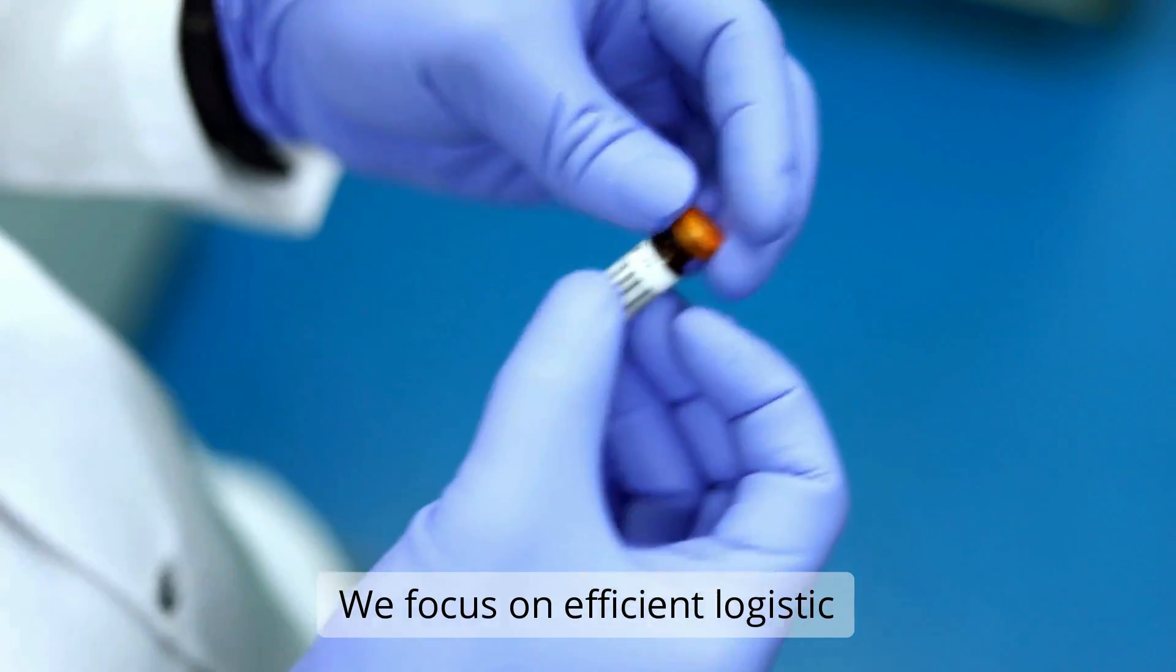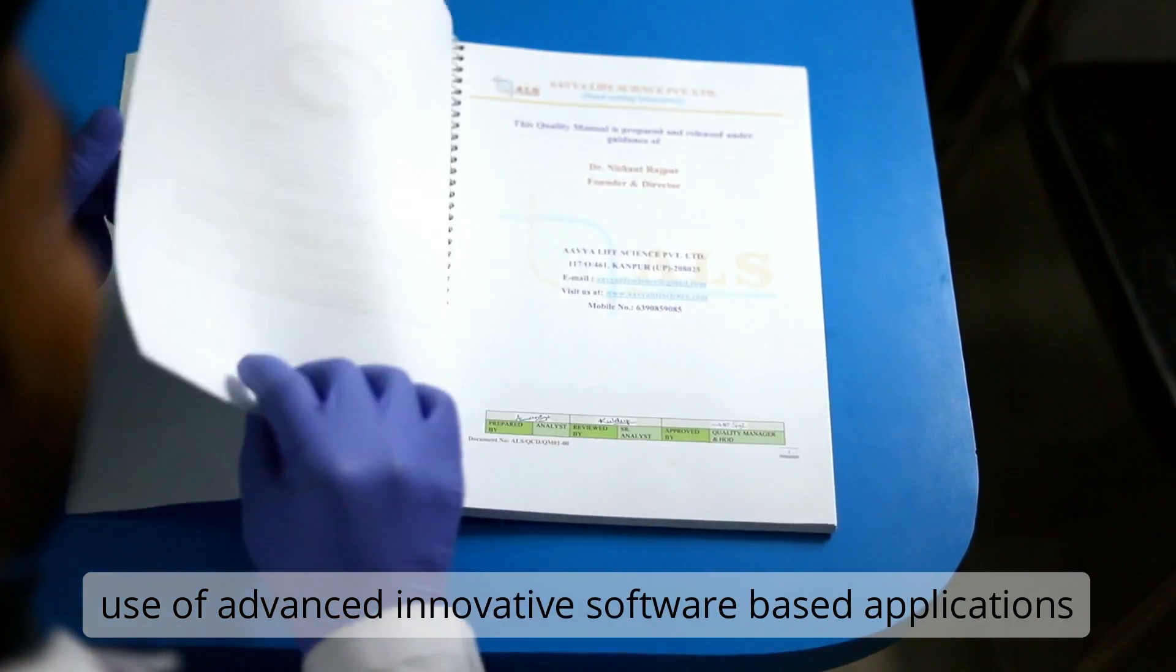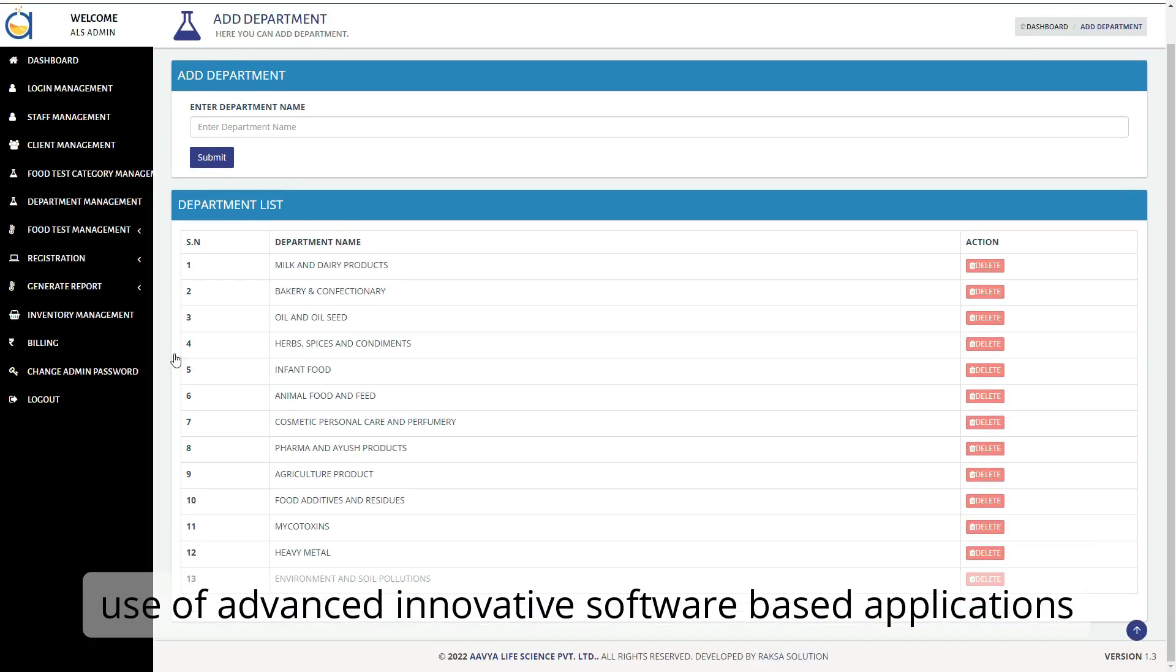We focus on efficient logistics and generation of authentic results. We ensure rapidity and precision by the use of advanced innovative software-based applications.